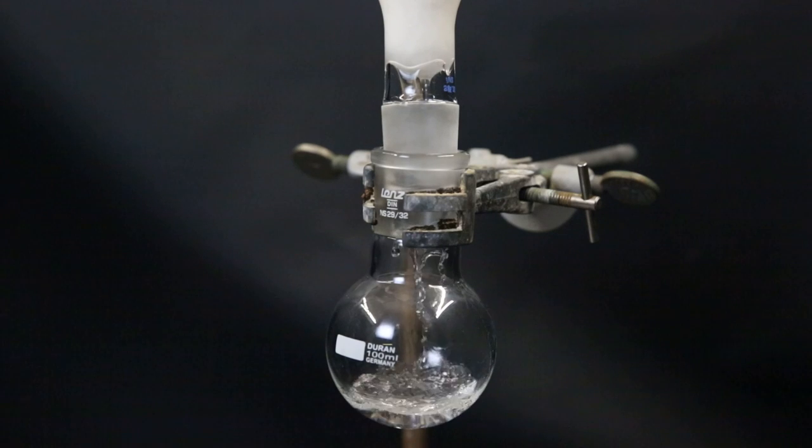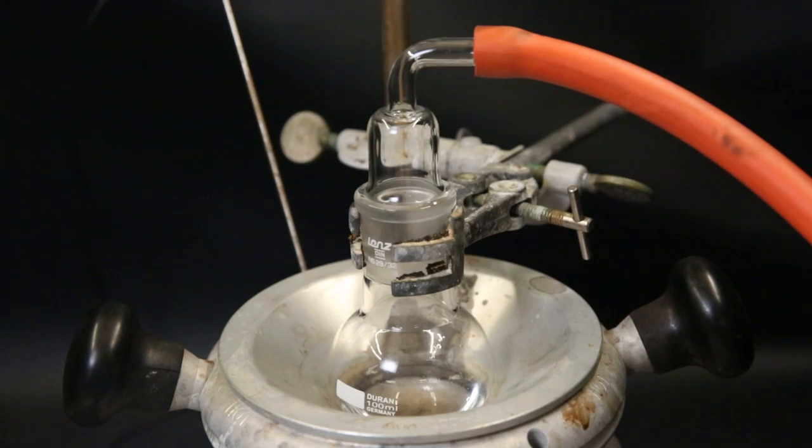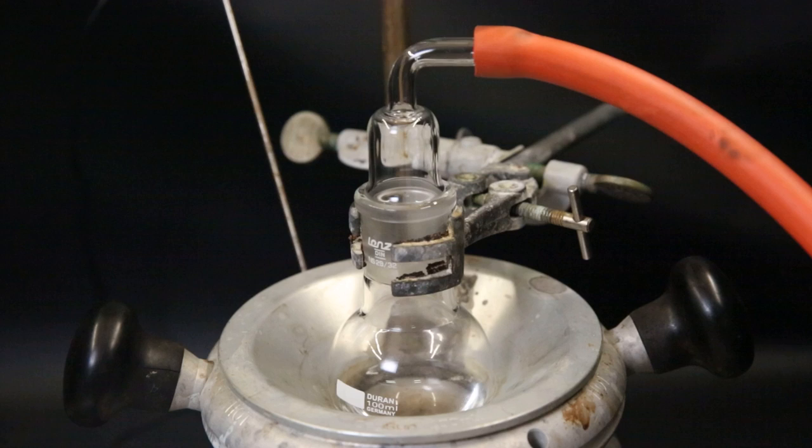I filter the mixture through some cotton and then move the flask with the filtrate to a heating mantle with a gas adapter. Like before, I heat the mixture lightly and pull a vacuum to remove all of the ether.